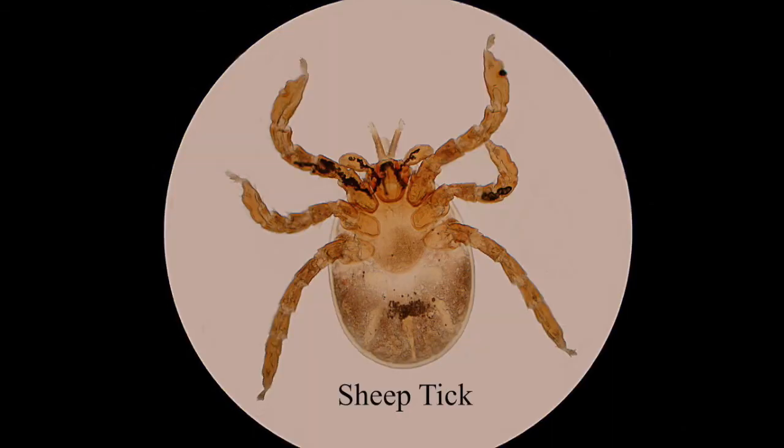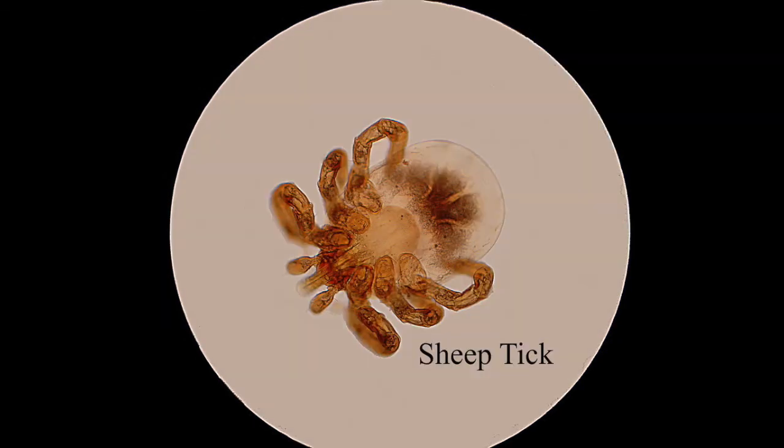This is a sheep tick. Sheep ticks don't carry Lyme disease — Lyme disease is carried by deer ticks. If you look at the body of this sheep tick, you see it's rounded and a very light, creamy color. With a deer tick, they're a much different shape — more elongated — and they're a lot darker, more of a dark brownish color. So if you ever find you've been bitten by a tick and you're panicking about Lyme disease, just check the type of tick first, because more often than not it's actually a sheep tick, which can't carry Lyme disease anyway.